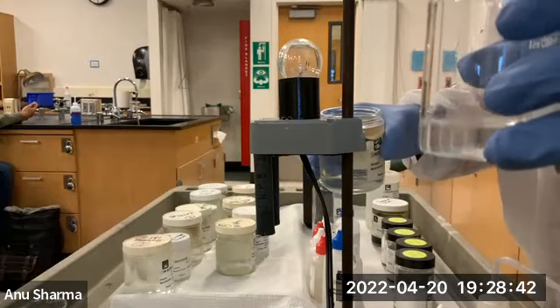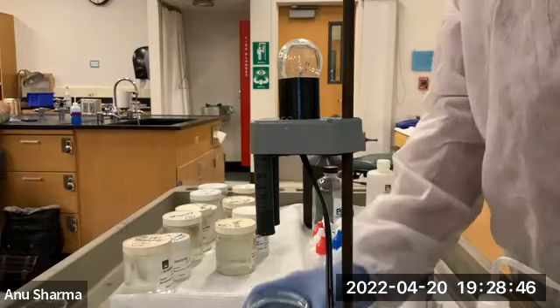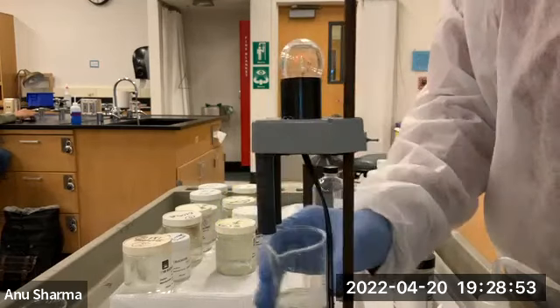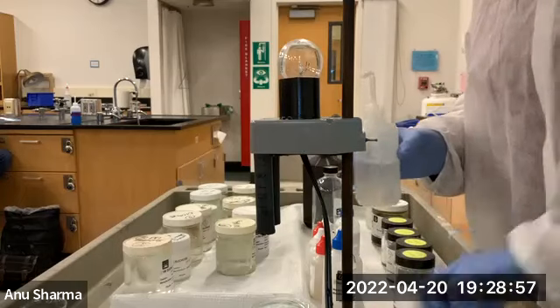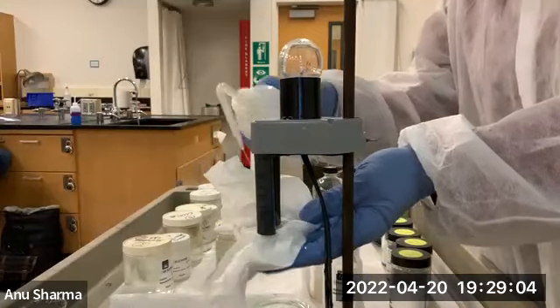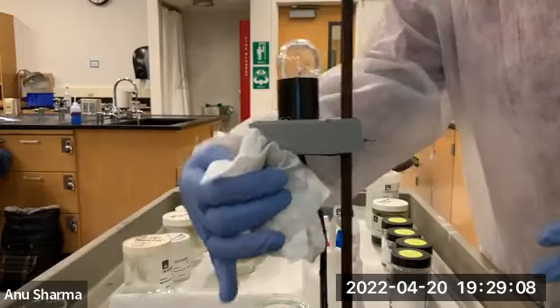Ammonia was a weak conductor before mixing, and acetic acid is also a weak conductor before mixing. So look at this again. Very weak electrolyte, ammonia. Acetic acid is again the vinegar.